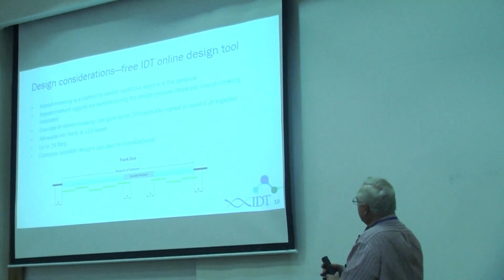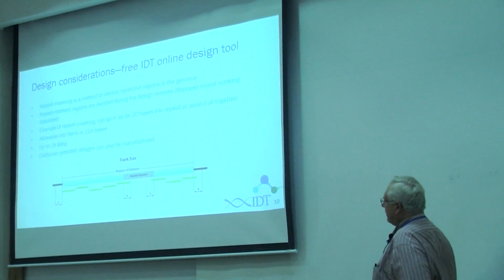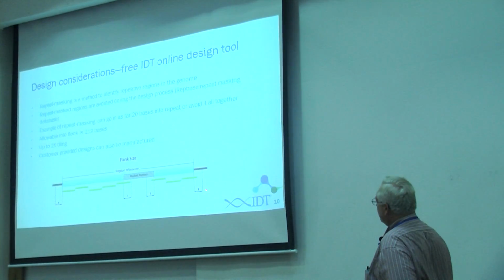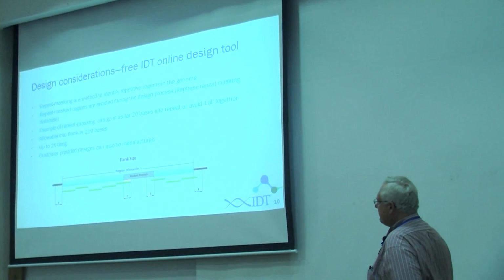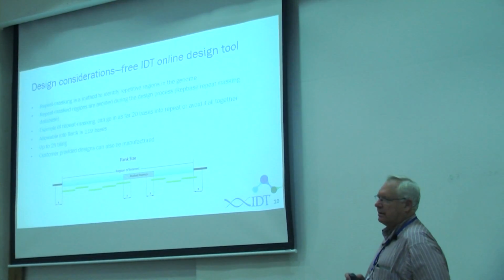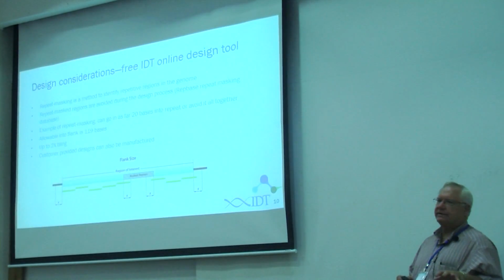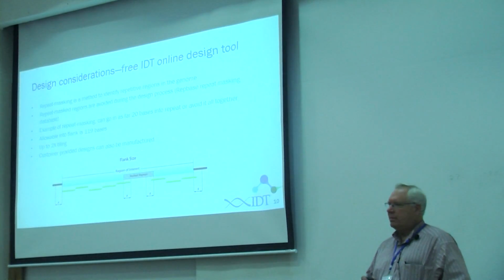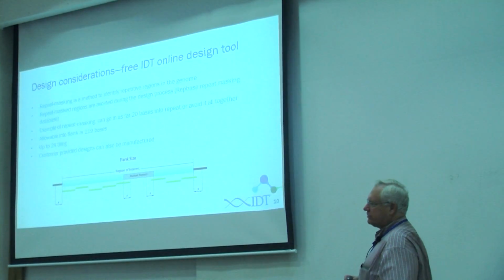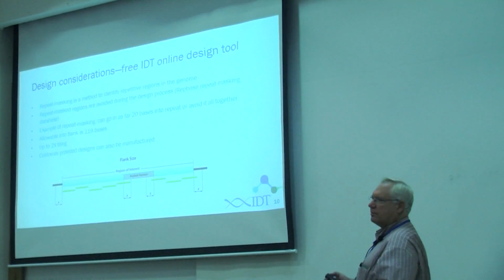So we've got an online design tool that will allow you to input a sequence, and it will array out the oligos for you to make these kind of pools. It will find repeats and mask them. And if you want it to be higher density than 1x tiling, you can go up to 2x with that. And some people do that if they're expecting areas with high frequencies of recombination. But otherwise, if it's just in a normal stretch of DNA and you're not expecting that, we think it's kind of a waste of money to tile more densely than 1x.